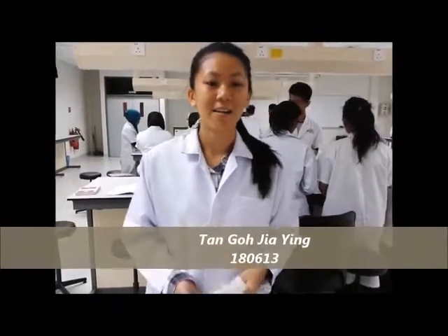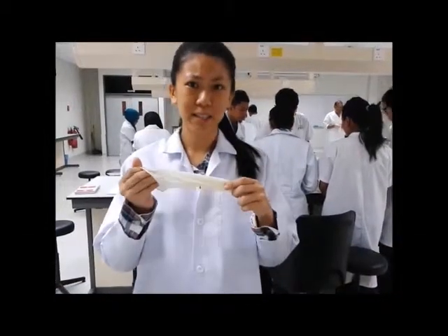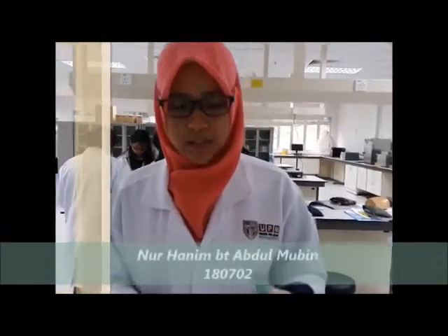Good morning everyone, my name is Jai and I'll tell you the importance of a glove during this experiment. Glove is very important and we should wear it the whole time when conducting this experiment, because we have a stop solution which is very basic, and it will corrode your hand if you didn't wear the glove.